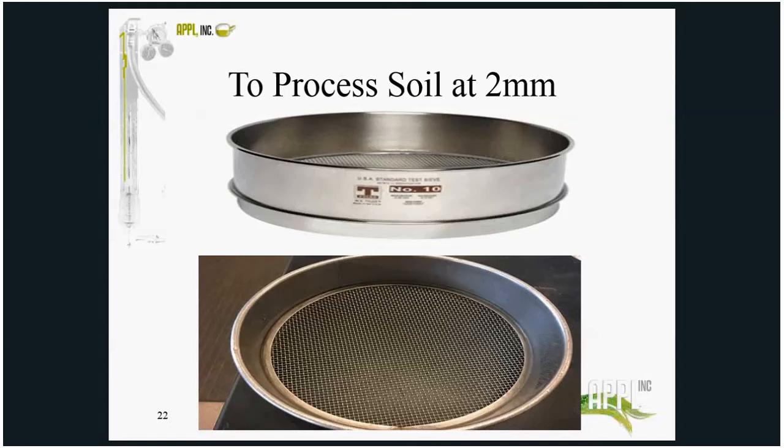A mortar and pestle can be used to disaggregate clumps of soil that remain on the screen. And it may be important to save or examine the greater than 2 millimeter portion of the sample if there's a potential for contamination of interest remaining, such as lead pellets, for an investigation of a former shooting range, or maybe large paint chips in samples collected around building foundations. In our laboratory, we typically keep the greater than 2 millimeter portion in a Ziploc bag with the sieved portion, so it can be examined at a later date if necessary.